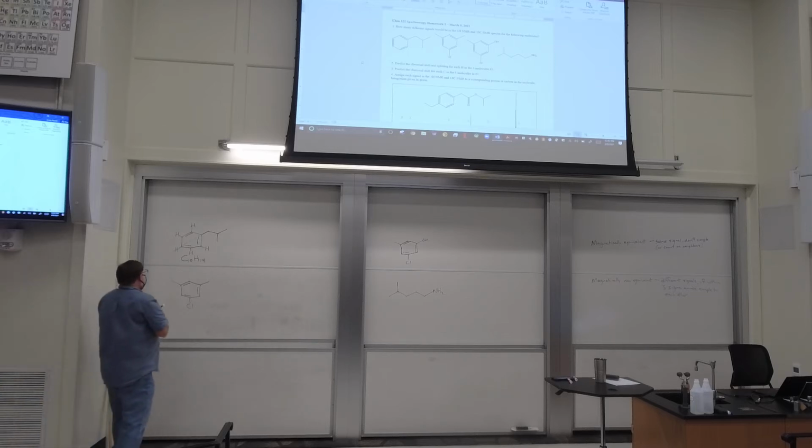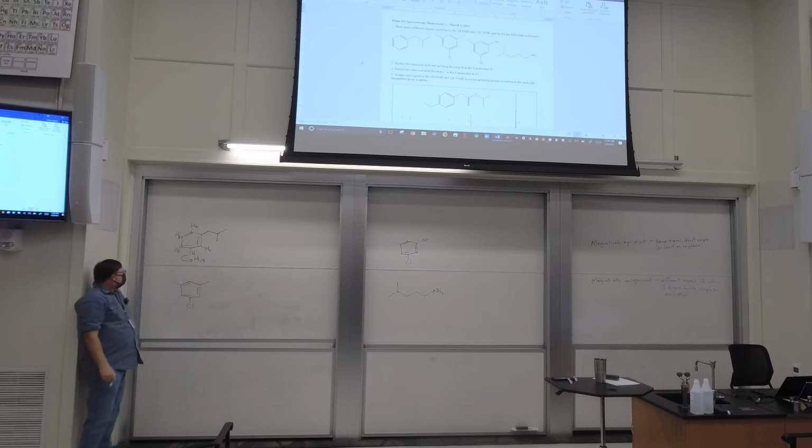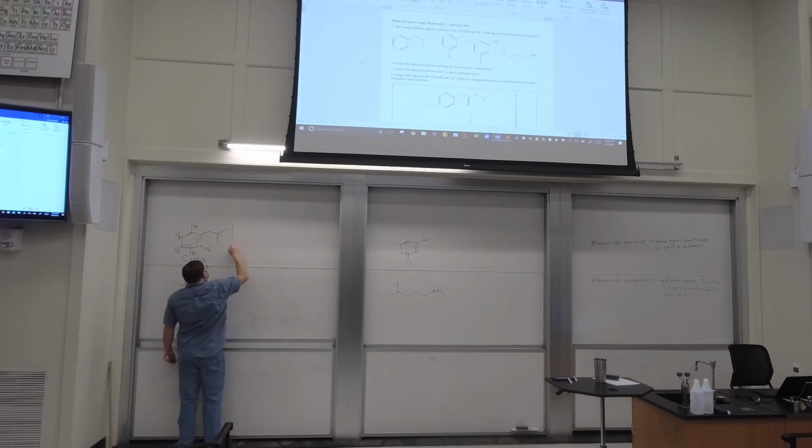So if we look at HA, let's just label them A, B, C, D, and E. So if you look at HA and HE, this is the replacement test.